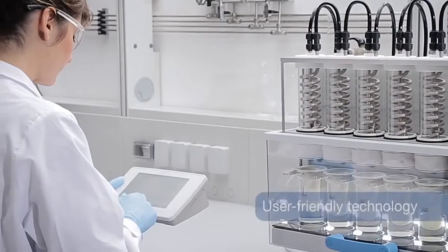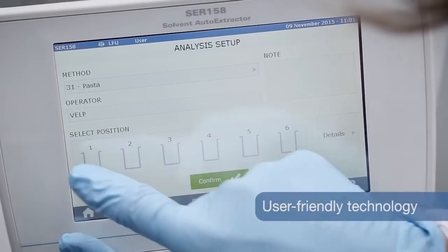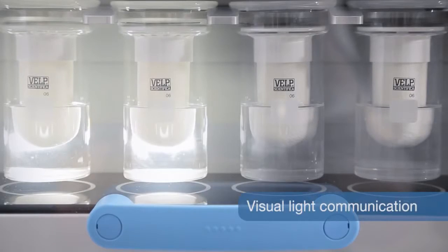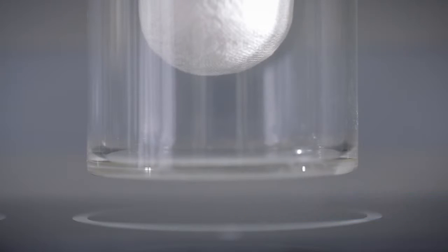From the choice of materials to the user interface, the system is designed to give the operator full and precise control of the whole extraction process.